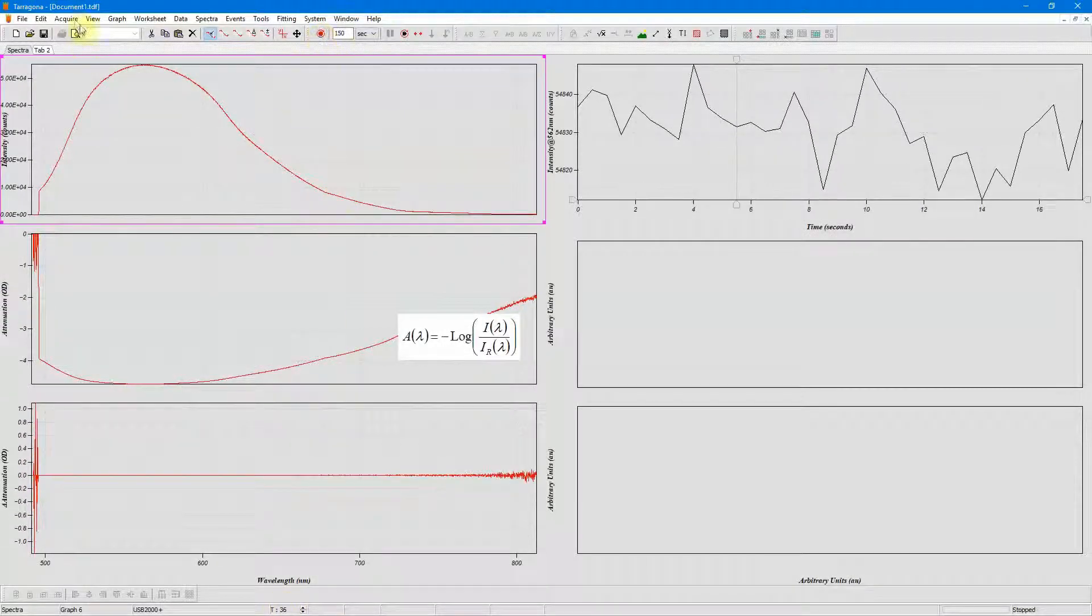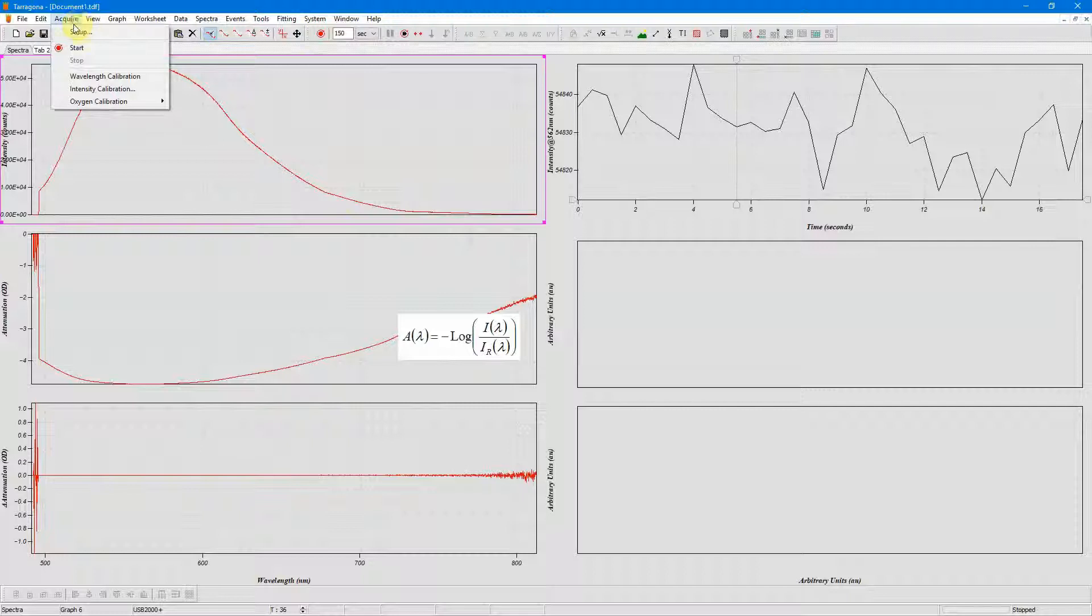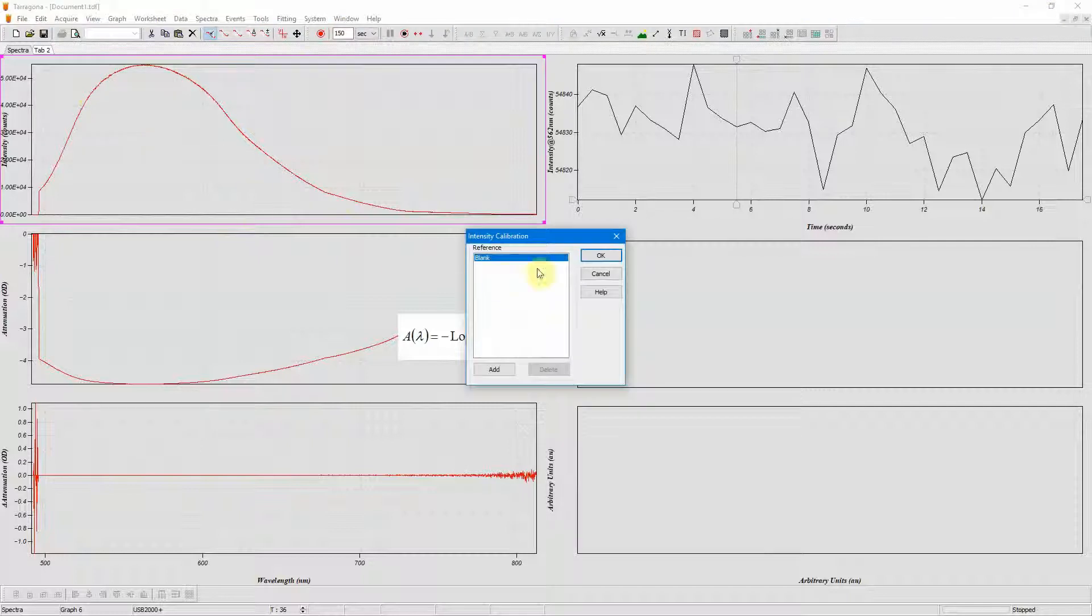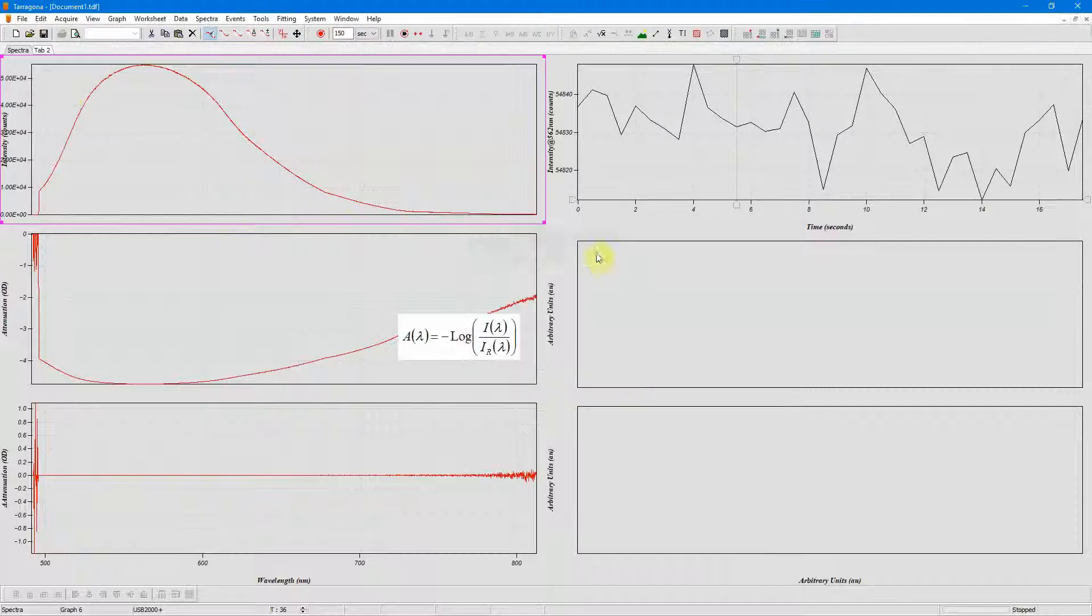I'll stop collecting and go to the acquire menu intensity calibration and just click OK. Tarragona will now average these spectra together to form the reference.